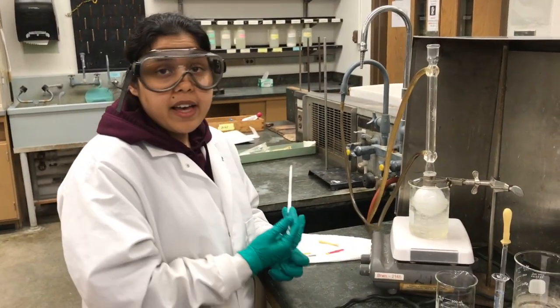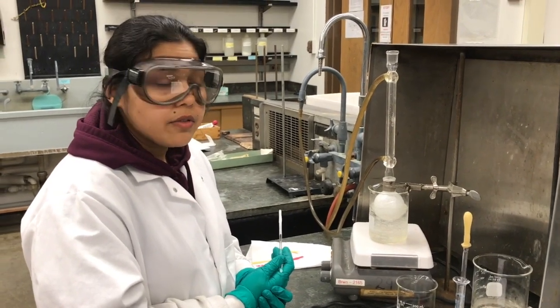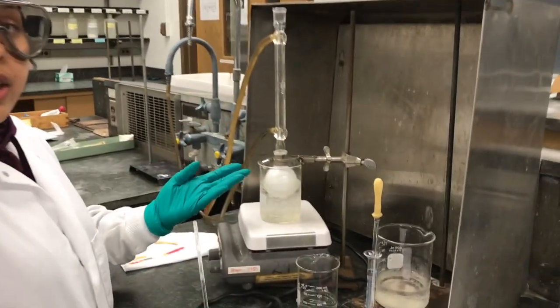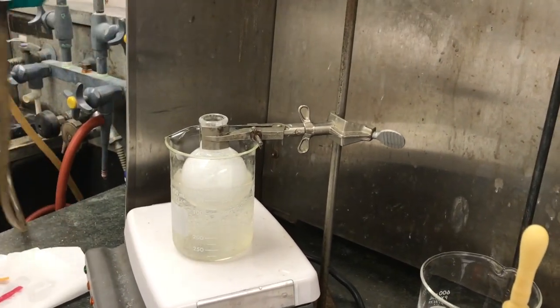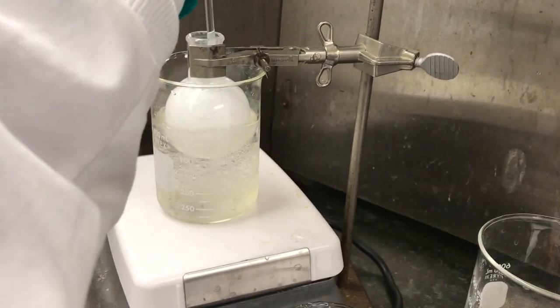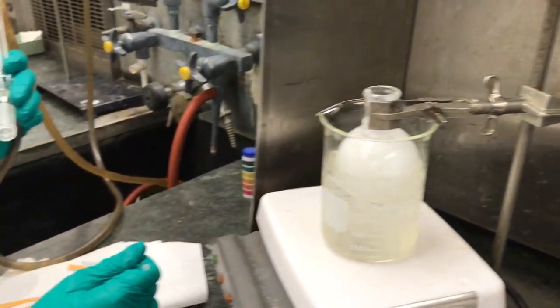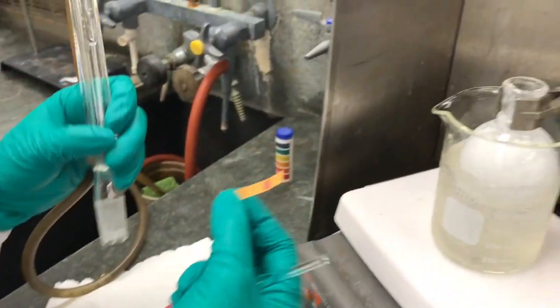Hi everyone, we are back again. I added about 9.5 mL of our 2.5 molar HCl. So we are going to check the pH now, whether it has turned completely acidic or not. The best way to test it is to take a glass rod, as mentioned earlier, stir it a little bit, take it out and put it on the pH paper. As you can see, the pH paper turned red.